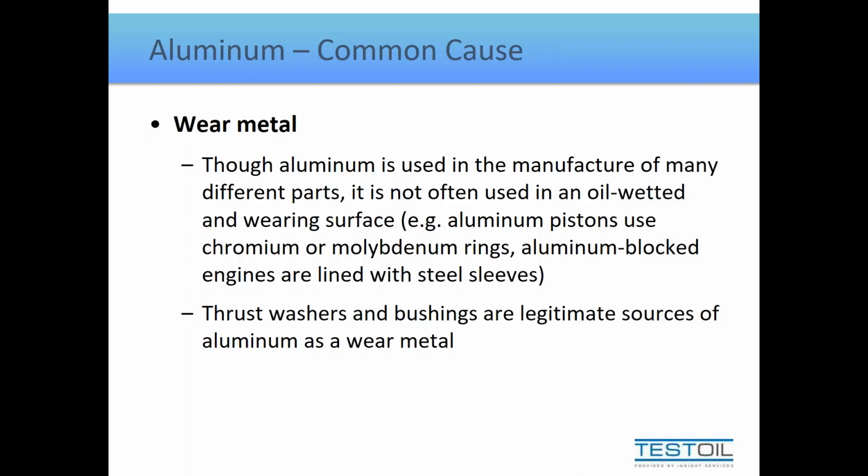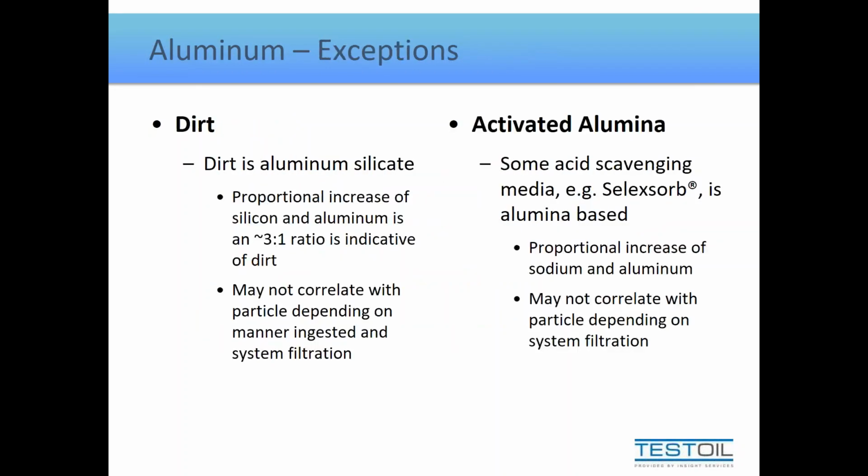In our lubricated components, what this means is that we don't have just normal airborne dust getting in, we now have large dirt particles getting in. So this might indicate to us a failure of the breather, a cap that's been left off, a dipstick that's fallen out, whatever it might be, but this is a larger particle requiring a bigger entry point. So it either took more extreme conditions or we've got less protection.